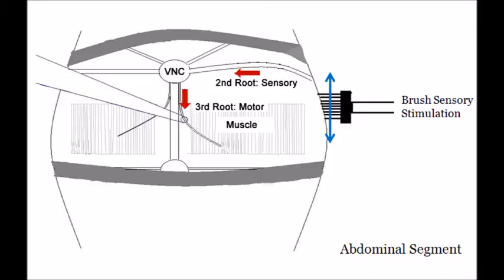Today we will be discussing LPS's effect on the central nervous system in the crayfish. We used a protocol where we stimulated the sensory nervous system by brushing the side of the crayfish abdomen, and we recorded from this motor nerve out of the third root of the CNS to the superficial flexor muscle.